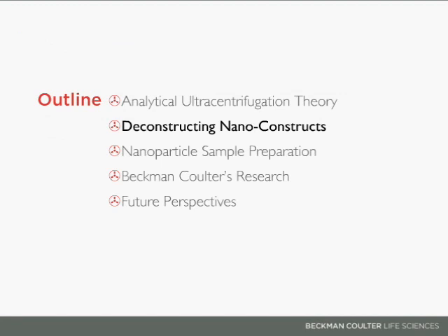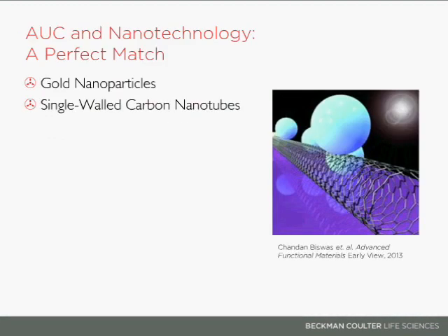And both are becoming increasingly closer to reaching the clinical trial stage. I believe gold nanoparticles are actually in the clinical trial stage for biomedical purposes. And as they reach this stage, the characterization of these nanoparticles becomes increasingly important. Currently, you can string together a few analytical techniques and get a rough idea of the overall structure of the particle and its surfactant and its aggregation behavior.